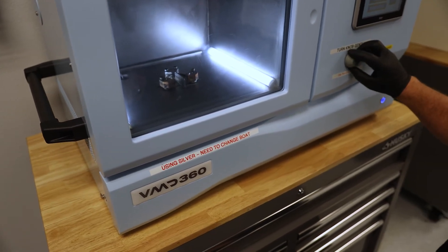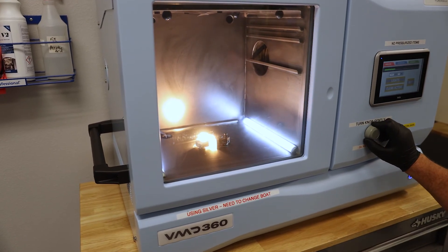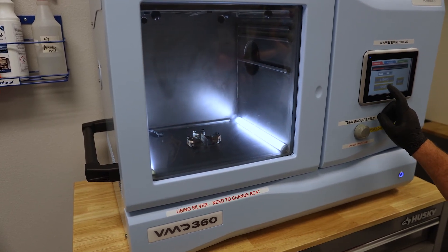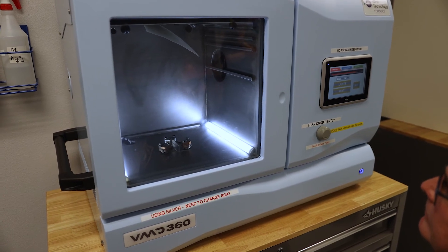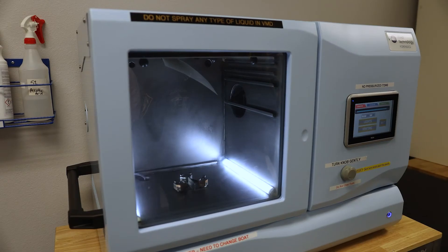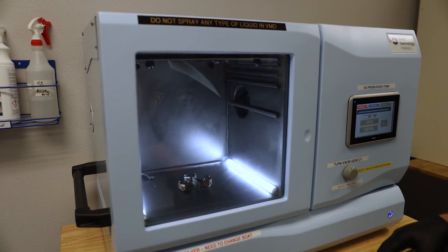At this point we can turn the lights on. Watch your eyes, because I'm going to burn off any excess gold that's in there — it's real bright. Turn that off. I'm going to vent the system down, which is going to allow us to take the evidence out of the chamber. It's allowing the outside air back into the chamber so the door can be opened.